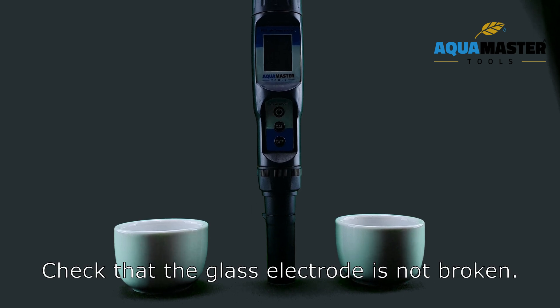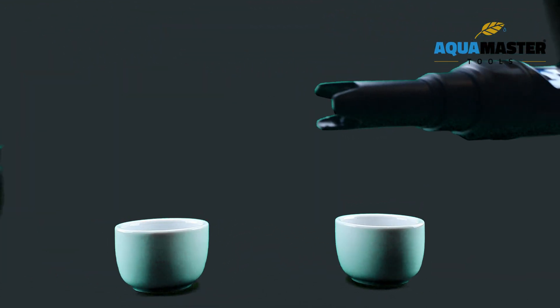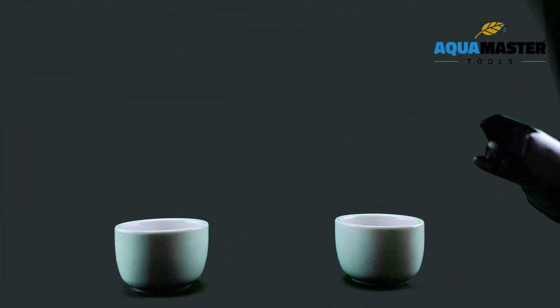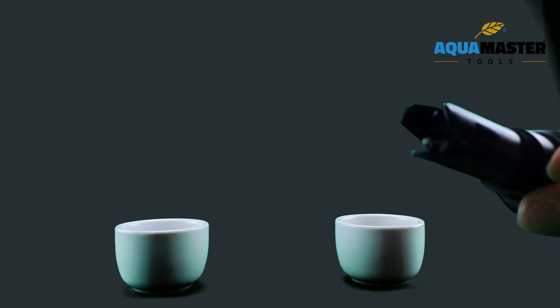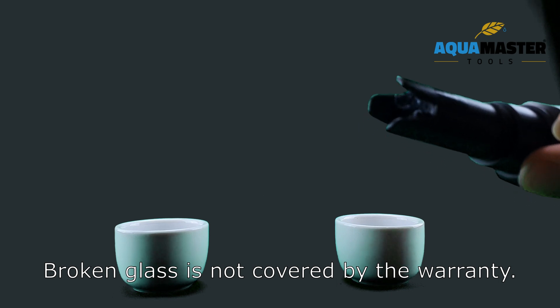Check that the glass electrode is not broken. Broken glass is not covered by the warranty.